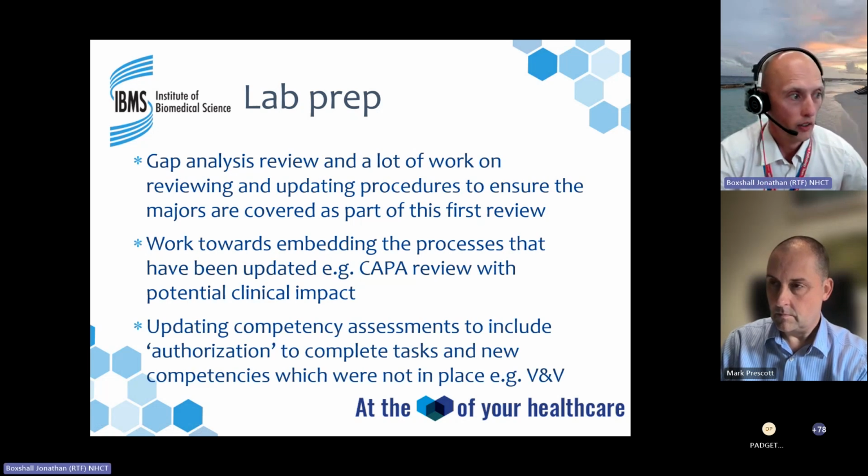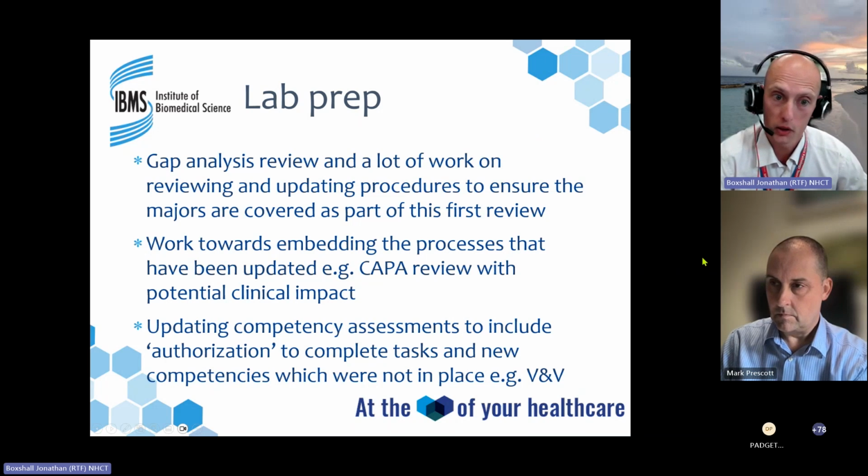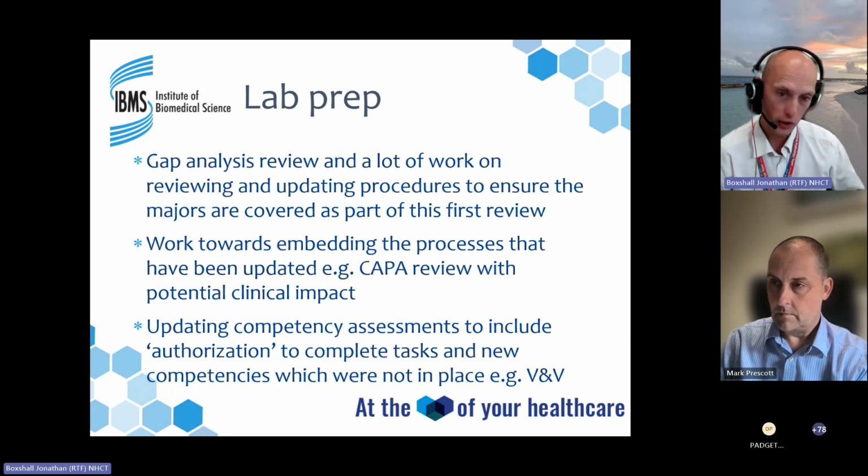And also updating competency assessments to include the word authorization to complete tasks, and writing new competencies which are not in place, for example, validation verification. So all this documentation got created. By no means is everybody in my laboratory who does validation verification, plan writing and reporting, they don't have it filled out, but we have made progress with some having evidence so that it's being done. And so that was accepted as well, to say we're showing that we're moving in the right direction.